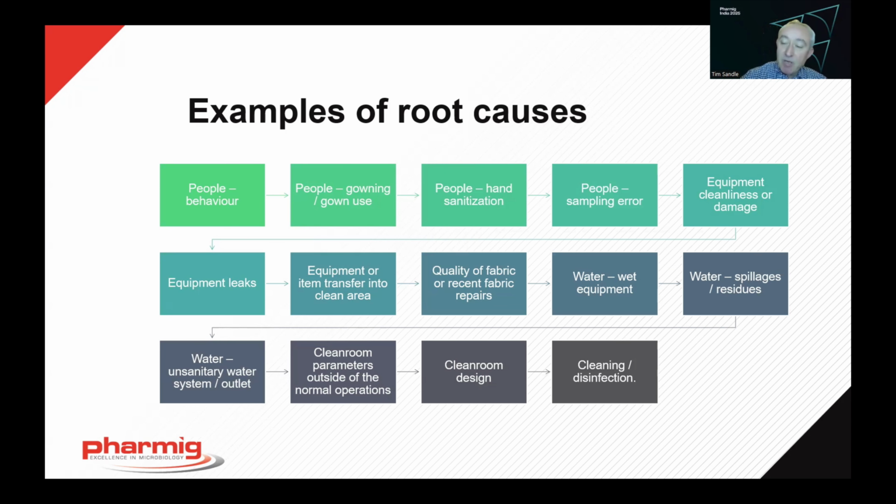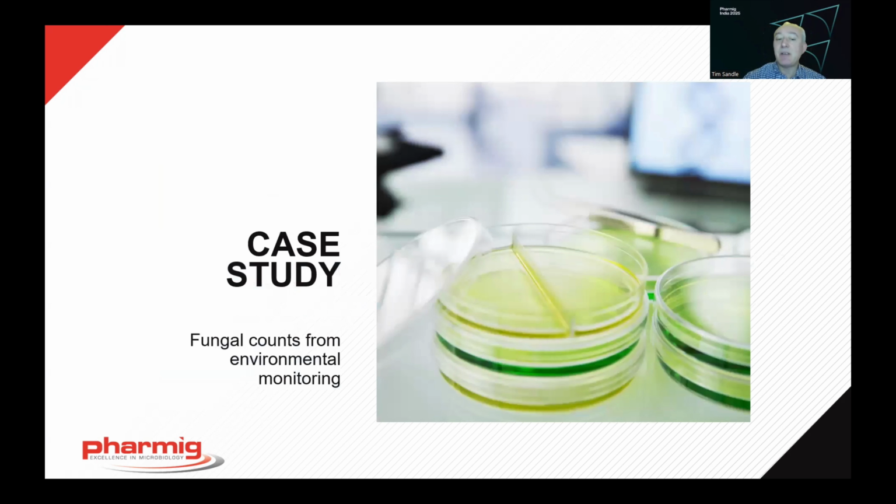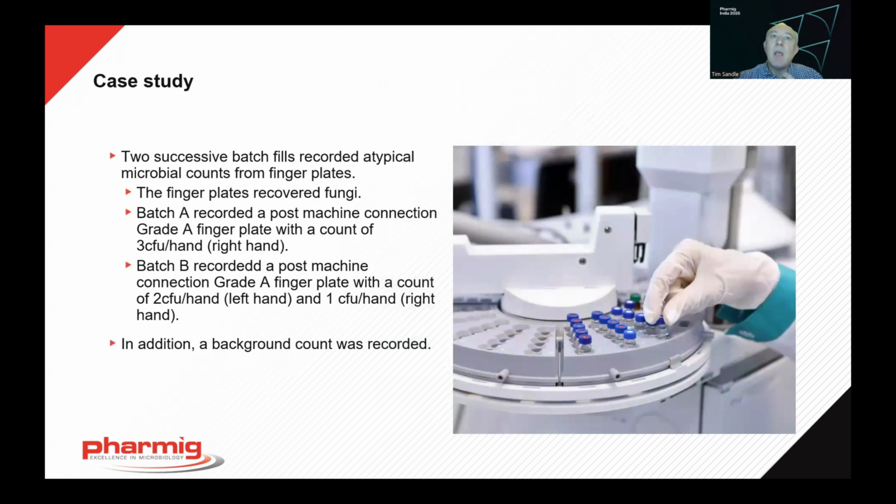So, in the time available, let's have a look at a case study. This case study is the presence of fungi, filamentous fungi recovery on our environmental monitoring. Something that we don't like to see, but can happen. This case study relates to aseptic processing.